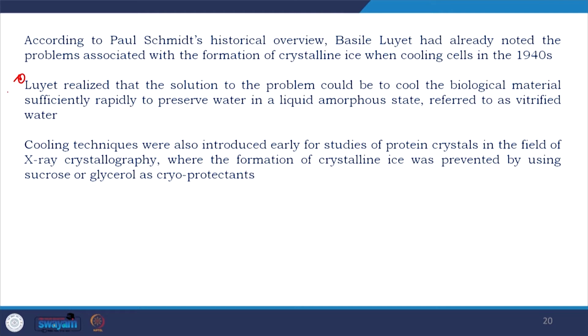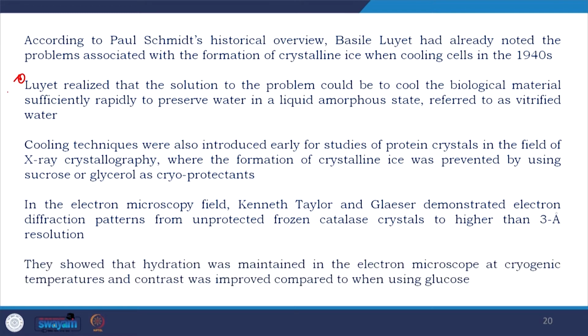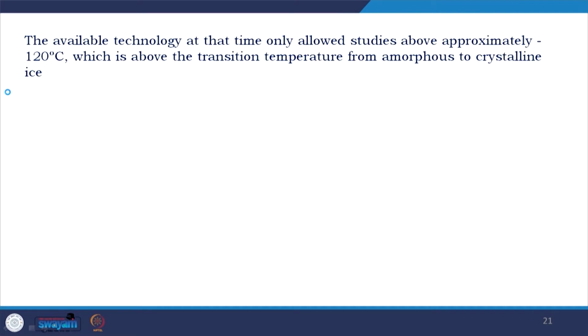When you are freezing, we use the cryoprotectant, because without the cryoprotectant, we will actually freeze the water, and water is a good diffractor. In the electron microscopy field, Kenneth Taylor and Glaeser demonstrated electron diffraction patterns from unprotected frozen catalase crystals to higher than 3 angstrom resolution, which is a revolution. They showed that hydration was maintained in the electron microscope at cryogenic temperature and contrast was improved compared to when using glucose as a cryoprotectant.